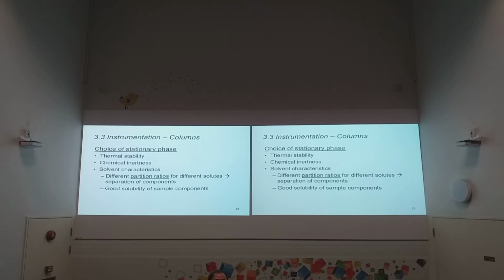We are saying that in the first place, the chemicals you're going to study must have this property, also called the character. They need to be volatile in the first place, right? So that's why in the injector, we are able to heat up the temperature and vaporize them.